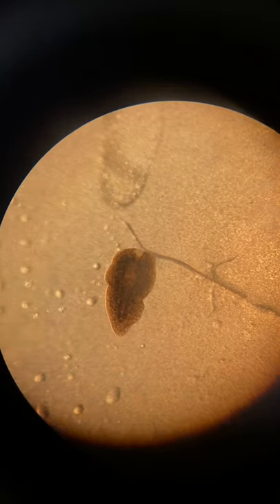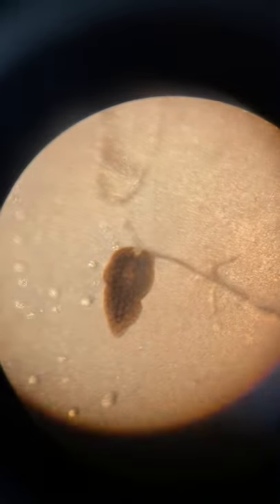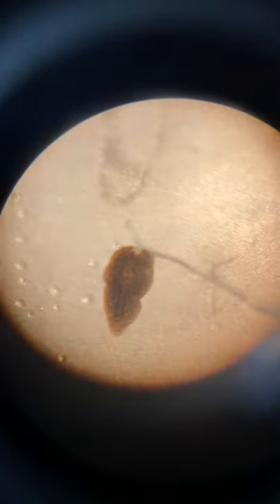You can tell just a little bit that his tail is starting to regenerate. This is the tail end and it's not really moving. You can see on the top side that little clear part is starting to regrow a new head, but it will take a little while.